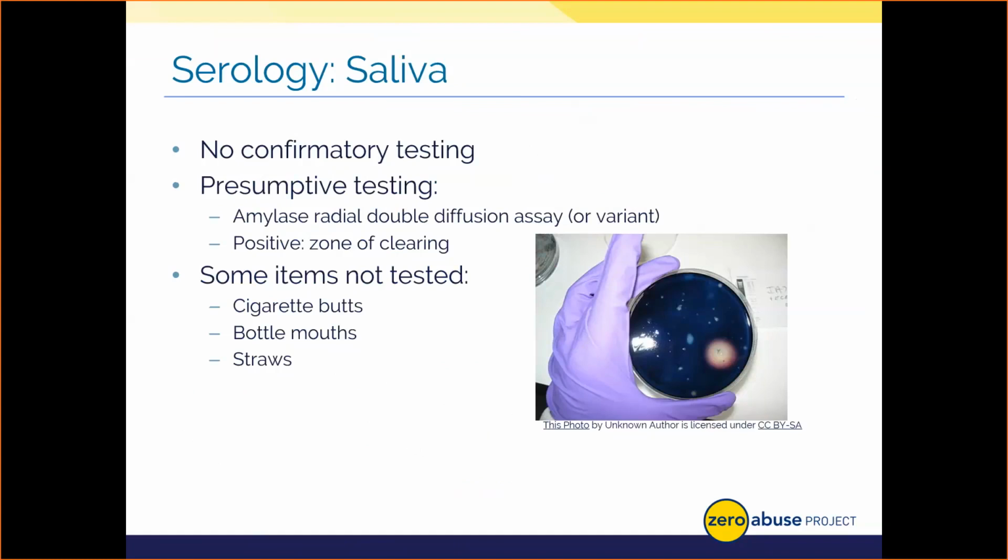Second, a component of saliva, which is the buccal cells from our mouth, is more forensically relevant since they contain DNA, as opposed to trying to determine saliva presence in most cases. After all, you'd rather have a DNA profile from the stain than determining if it's simply saliva or not. Now, saliva is basically amylase in water, so it's just not that specific as a body fluid in our system. So we can't get really detailed in its analysis at the moment, unless we consider novel or new methods.